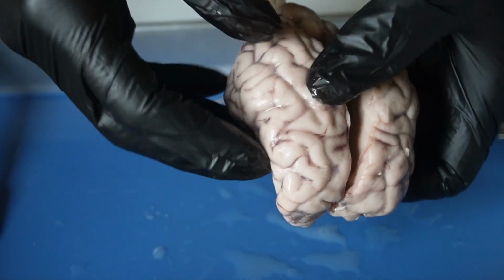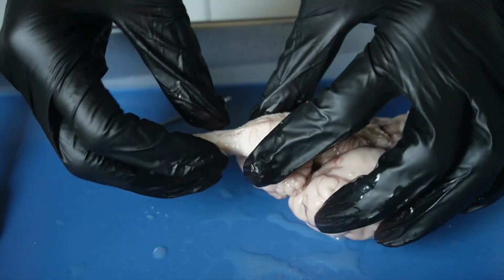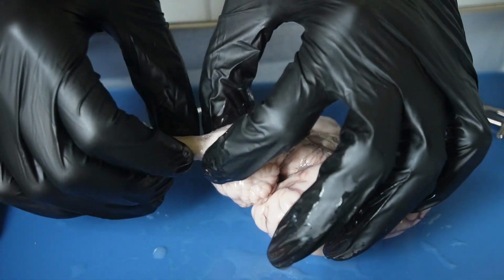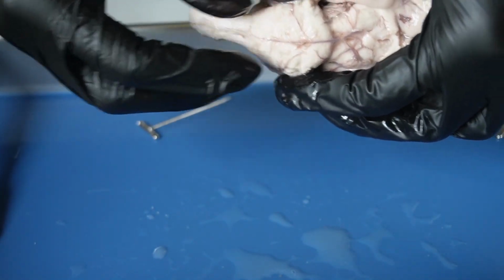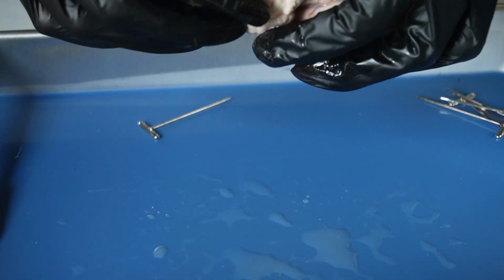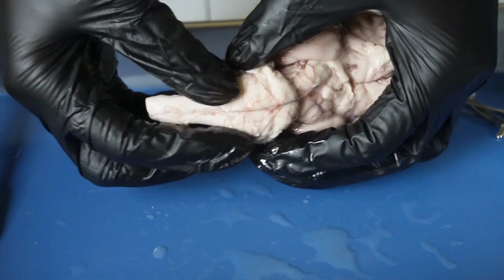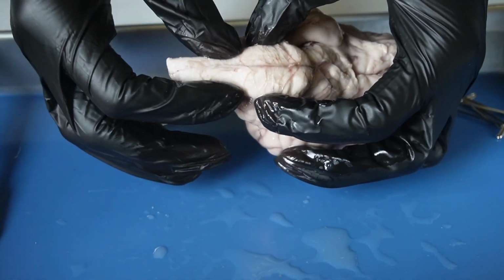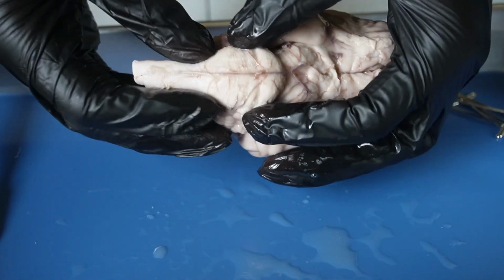All right. And then if I turn the brain over, well, we're going back to the brainstem. So this would be the pons, and the pons is, like I said, in the brainstem, and it's above the medulla oblongata, and it facilitates our sleep.